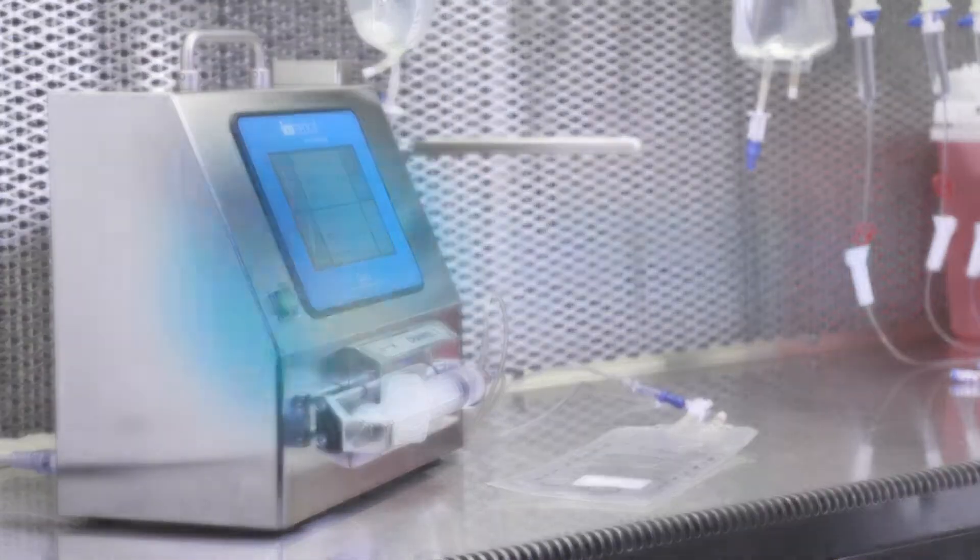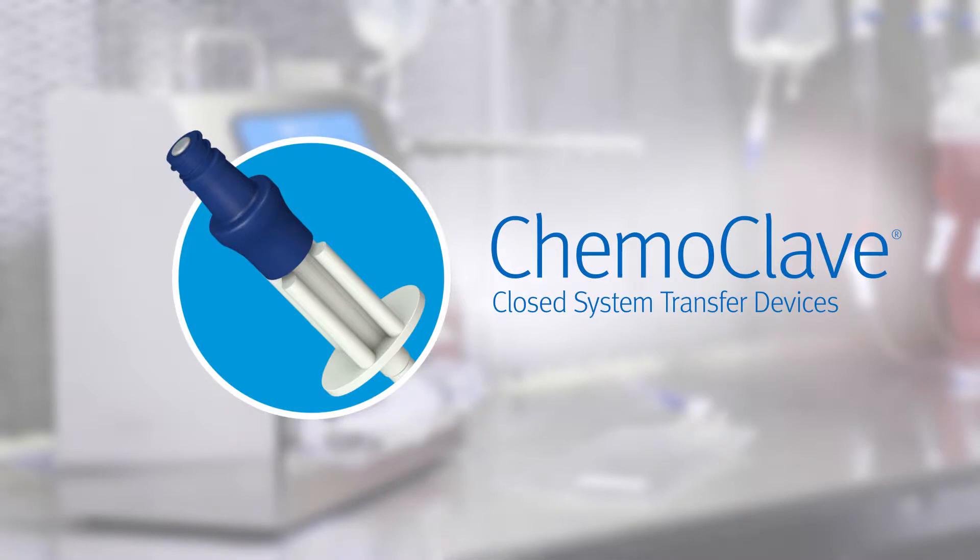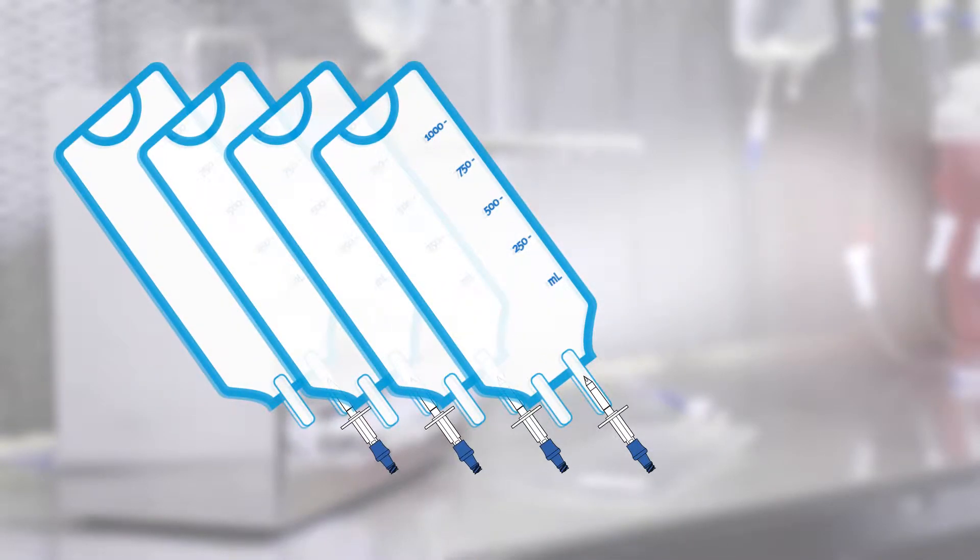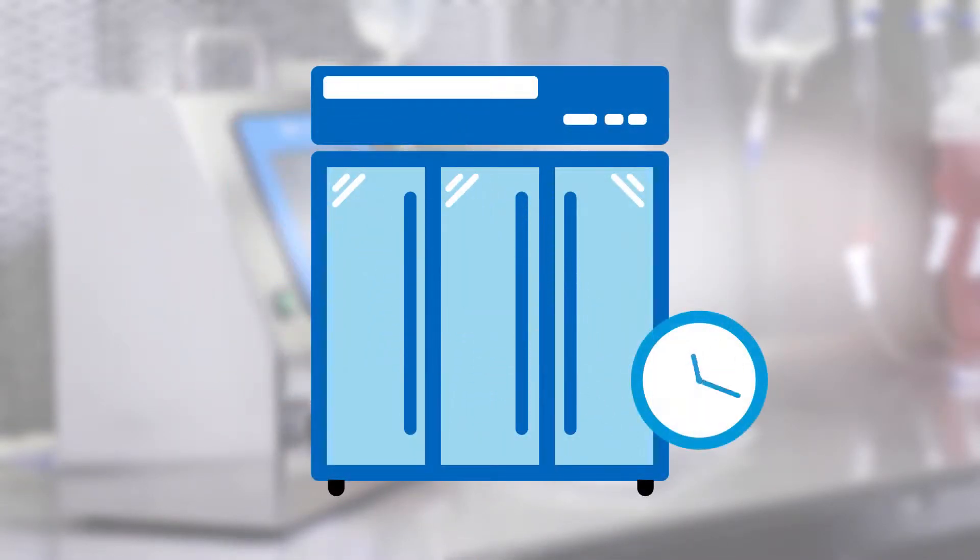And by incorporating ICU Medical's proven Chemoclave Closed System Transfer Device components, you can safely store and maintain the sterility of your stock solutions.